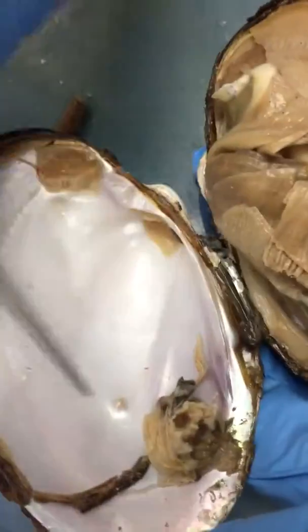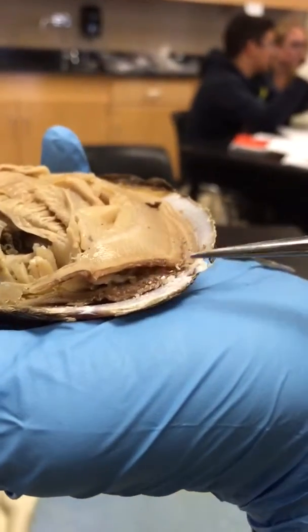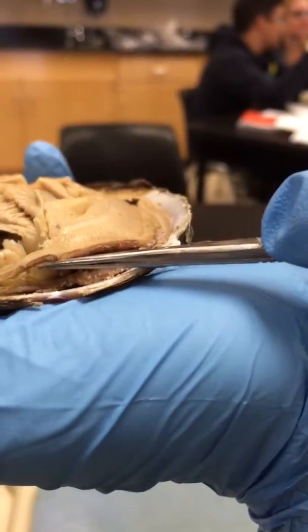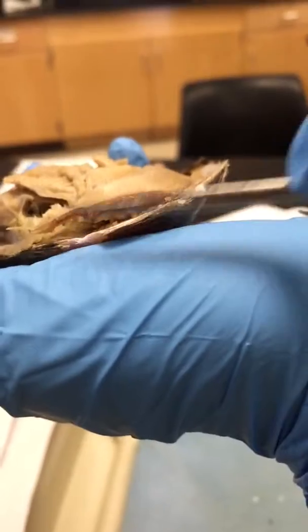Mother of pearl is just the shiny back. There's the middle, and this is the incurrent siphon and excurrent siphon.